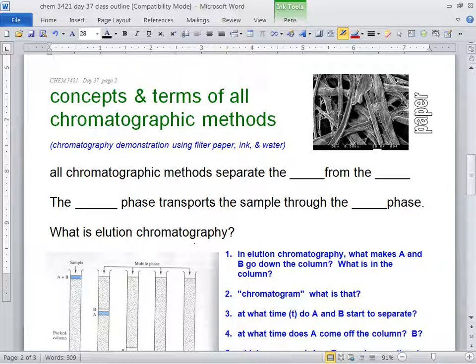Does it have to be pure? Yeah, it just has to dissolve. It can be a mixture. We could dump some ethanol in here too, whatever. In fact, changing the mobile phase is a whole other parameter of chromatography. You can really help things out by changing the mobile phase, but we're not going to. We're just going to stick with water.